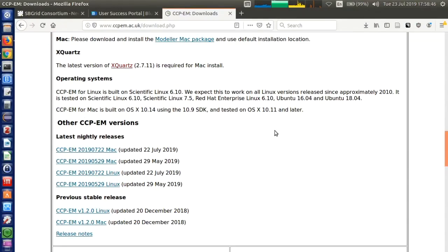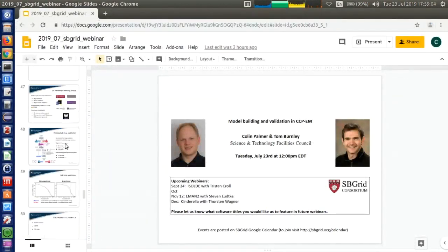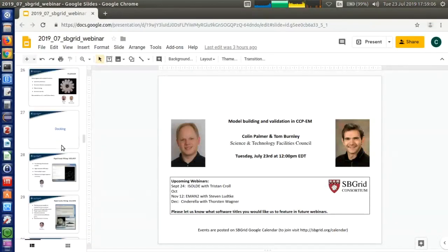Are you going to build a graphical interface to a sort of on-the-fly pipeline? The RELION script requires a certain amount of editing and tweaking and modification, and I was wondering if there's going to be a graphical element to that, so that people and facilities would be able to set that up a little easier.